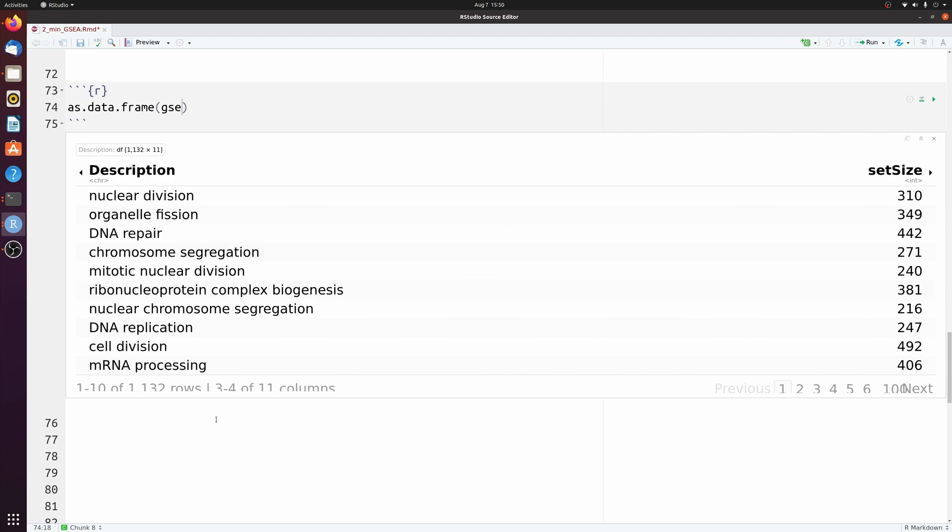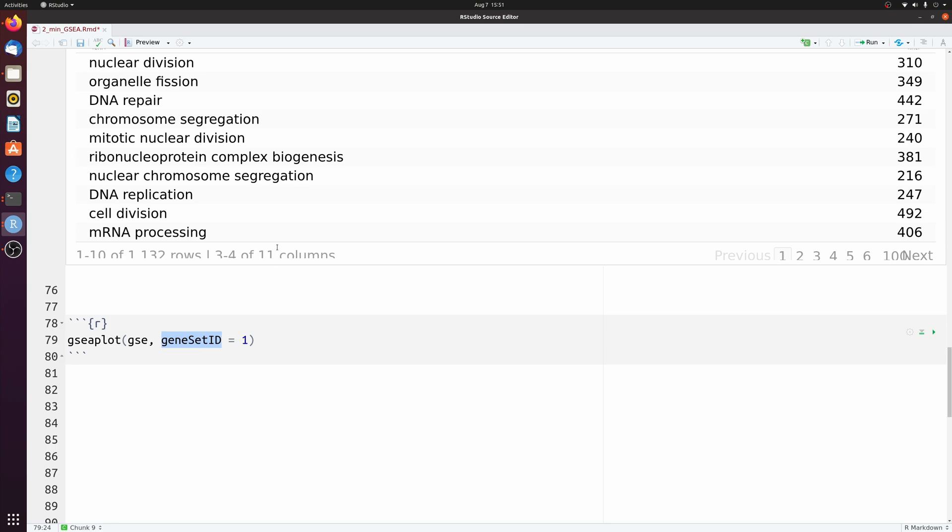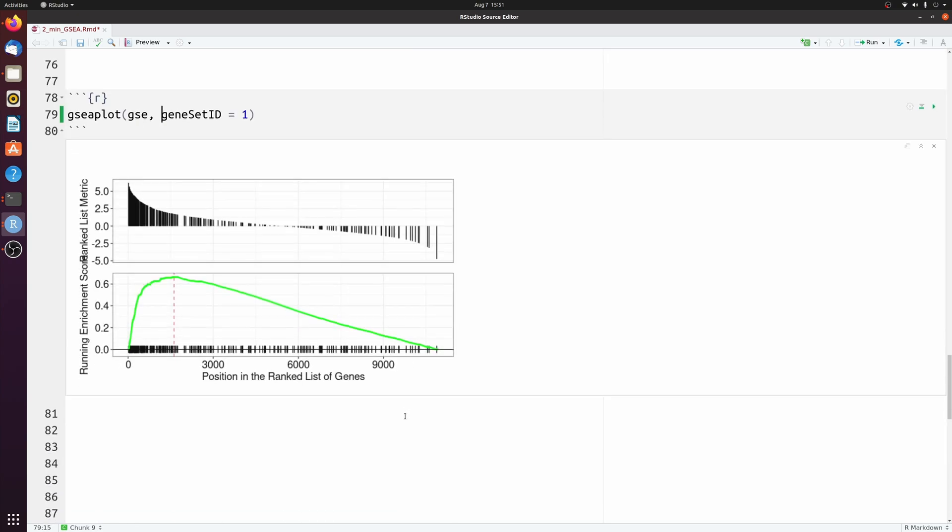So if you check out the ClusterProfiler site, you can see various other things you can do with the results. But I'm just going to show the classic GSEA plot. And we're just going to pass one for the gene set ID, which will just be the first one that you see in this data frame.